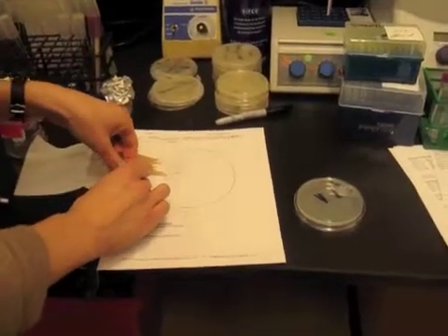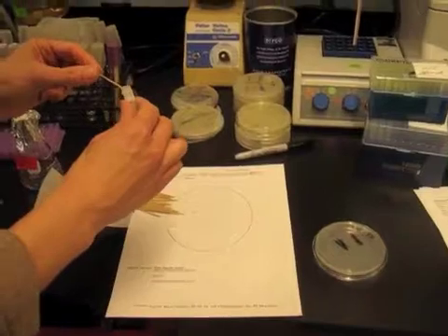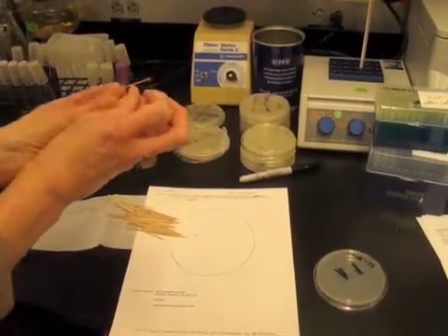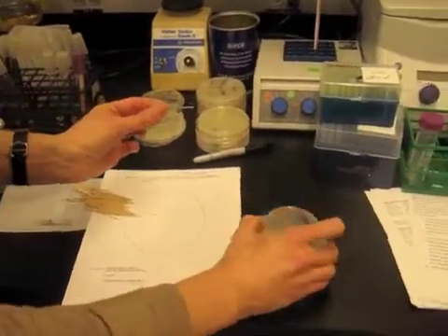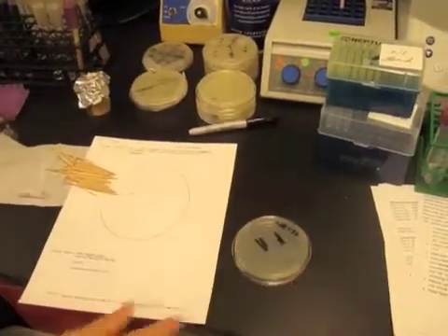This is streaking out a frozen stock of cells. I'll take a small dab from this liquid, this minus 80 stock we have, and put it onto a sterile toothpick, and then put a dab into a corner of a LB ampicillin petri dish.